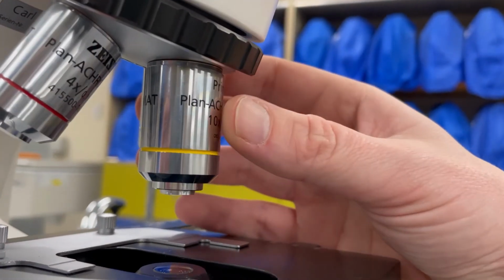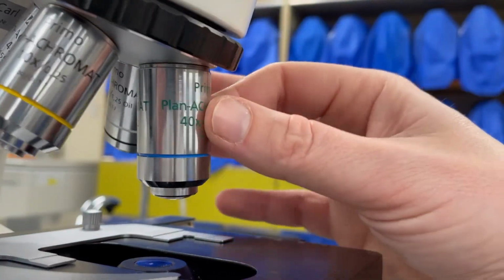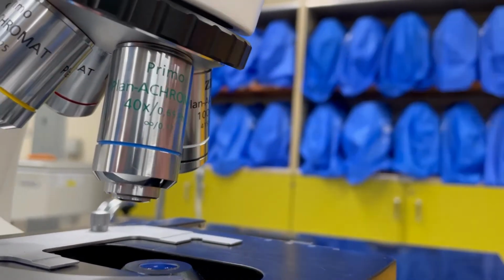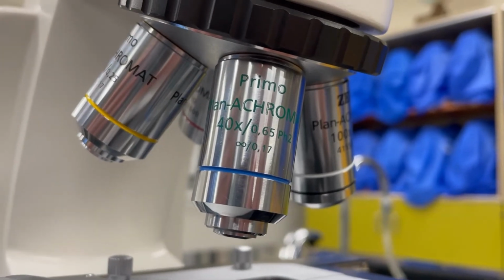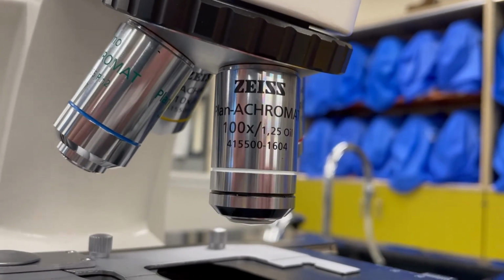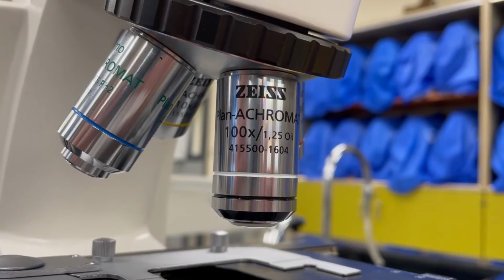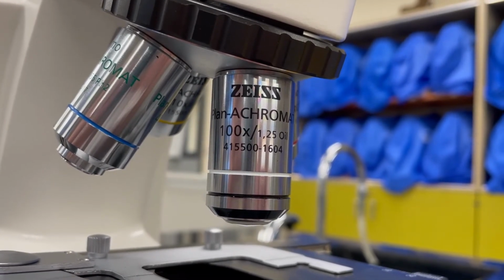So over here, this is the 10 times objective lens. This one with the blue on it is the 40 times objective lens. That one's pretty commonly used in Biology 107 because it's really good for looking at eukaryotic cells. And then lastly, we have this white one. This is the 100 times oil immersion lens, and we're going to use that in Lab 4 when we look at bacterial specimens. So a little bit more on that later.